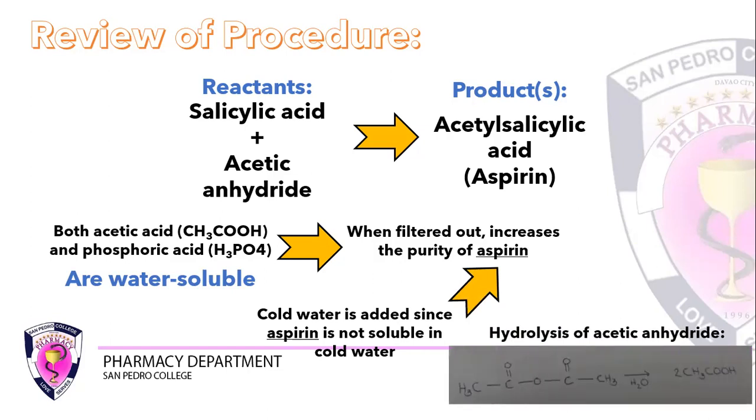Tapos aside from that one, from the filtering process, ang acetic anhydride also, it undergoes hydrolysis reaction. So it will result to acetic acid. So eventually ma-filter out yung ating somewhat yung ating acetic anhydride. So technically parang pure dapat na aspirin ang ating makukuha sa experiment.